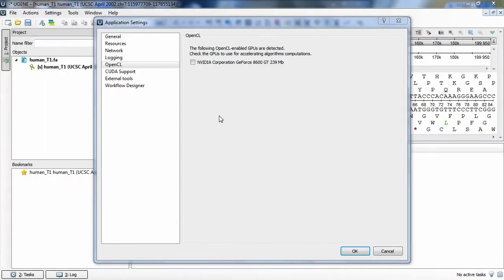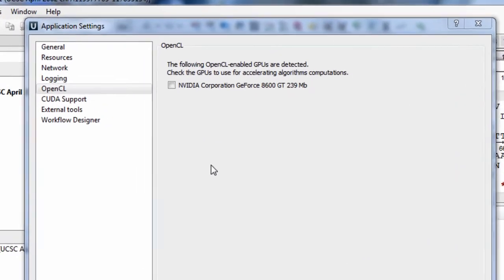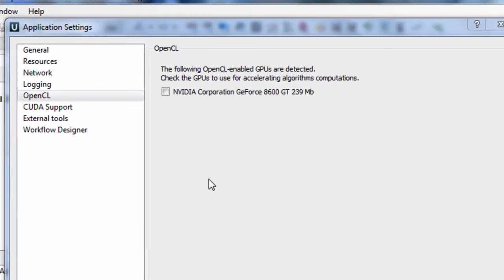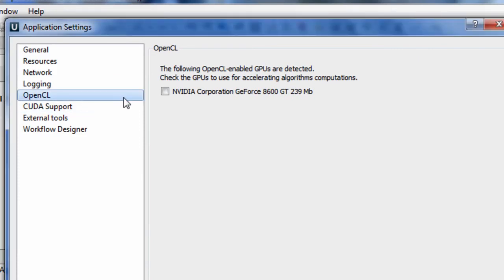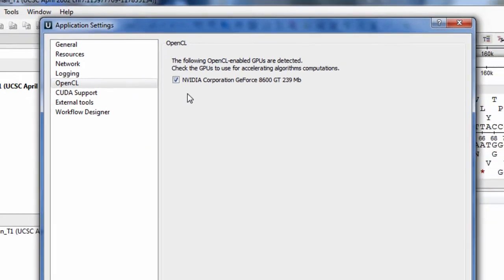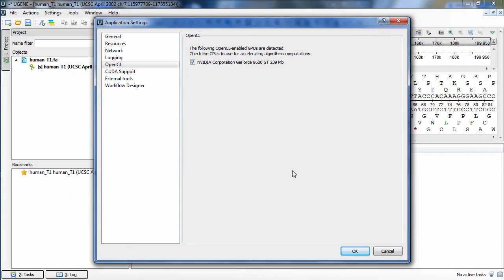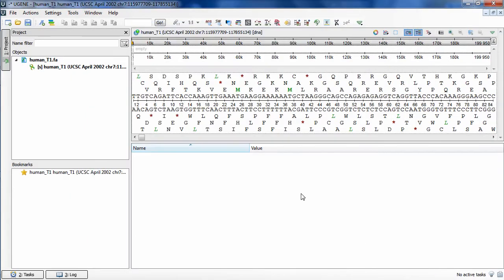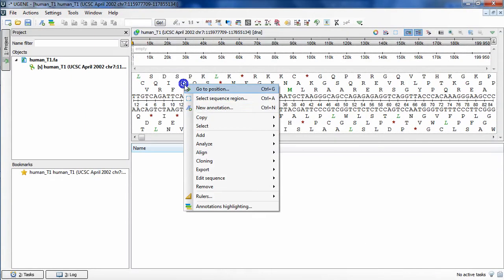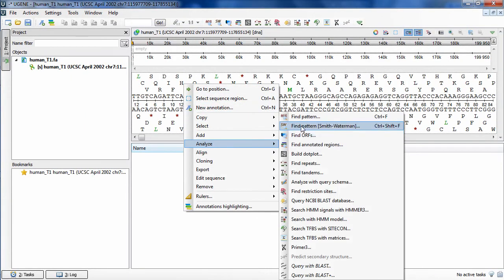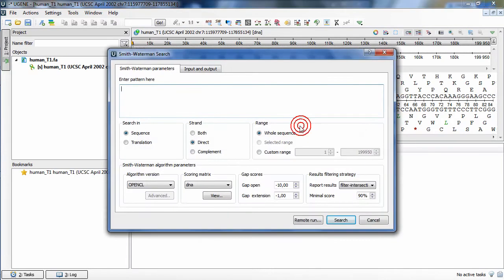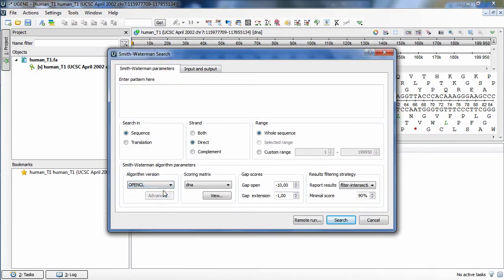GPU computations enhancements. Since 1.9, UGENE supports the OpenCL library, that makes UGENE GPU computing available on different platforms. You can use the resources of your video card to perform such algorithms as Smith-Waterman on Windows, Linux and soon on Mac platforms.